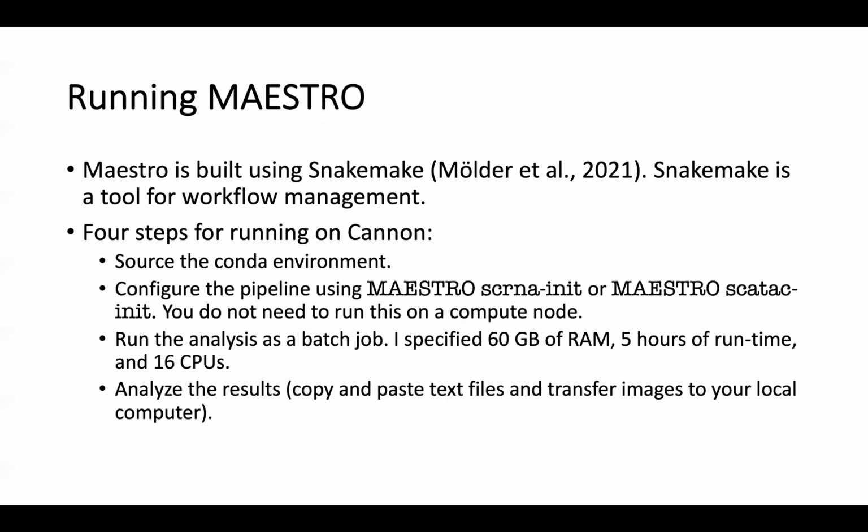Inside your shell script, do you source the environment? Yes, I did. And I saw this on the Slack, and you double checked that there's no typos in the Lisa directory? Yeah, I did.